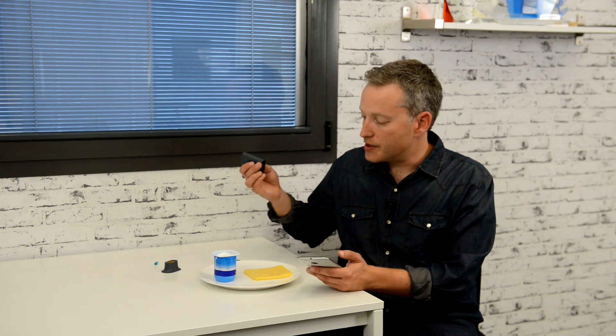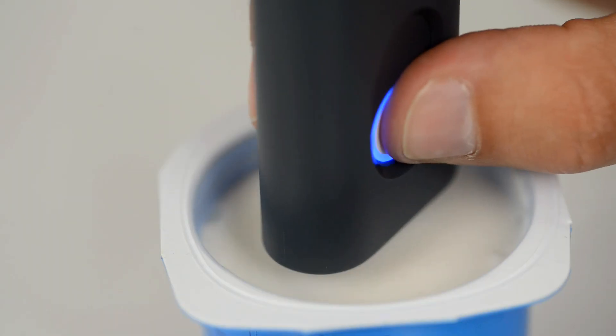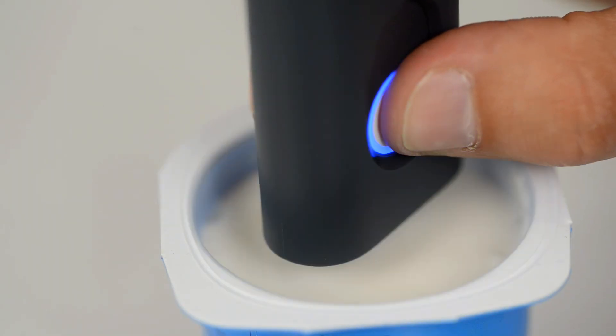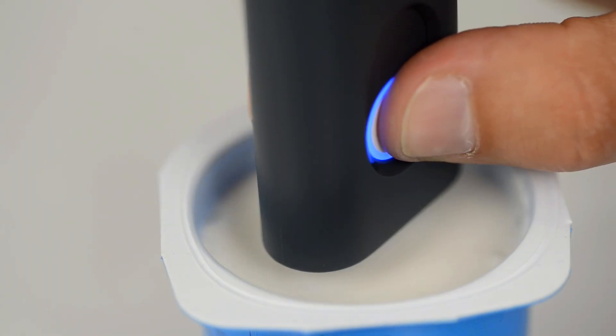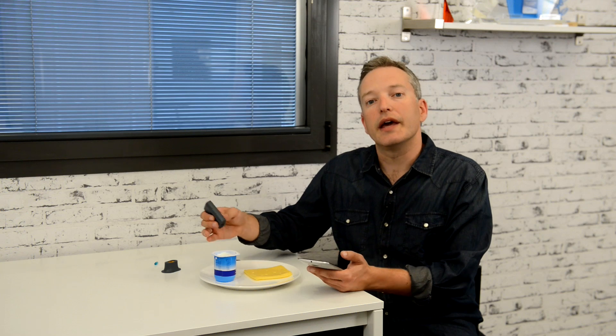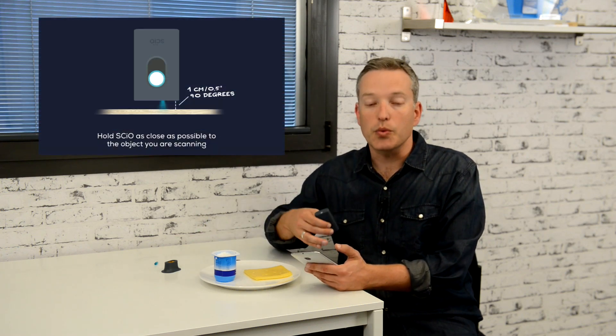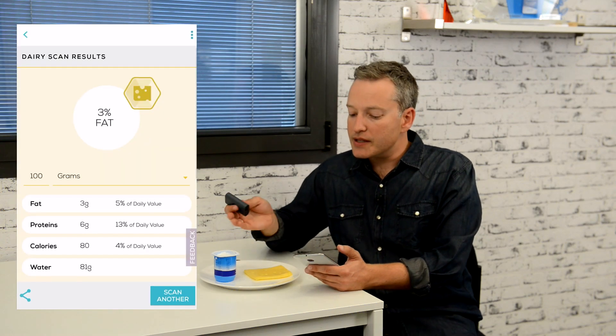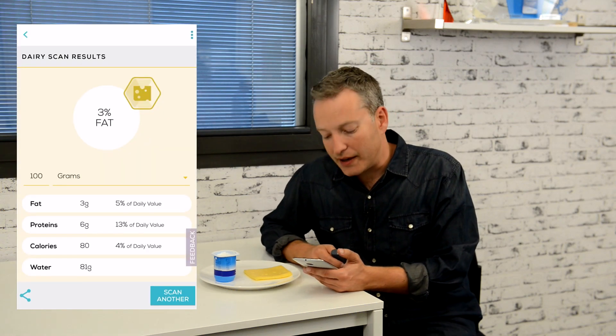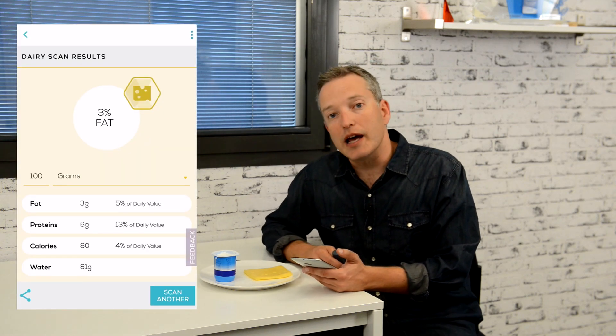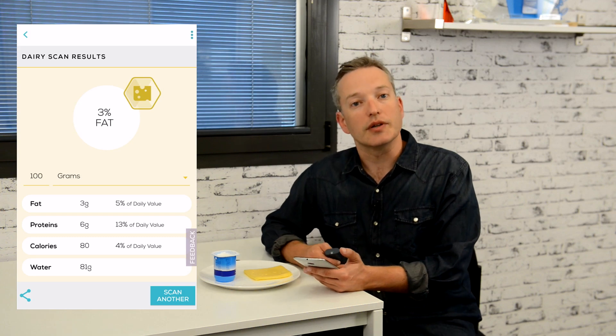And now I'll scan the yogurt. Because the yogurt is moist, I don't want the optical shade to touch the surface, so I removed it, click the function button, and scanned at about one centimeter or half an inch away from the yogurt without actually touching it. It tells me it's got 3% fat and 6 grams of protein in every 100 grams.